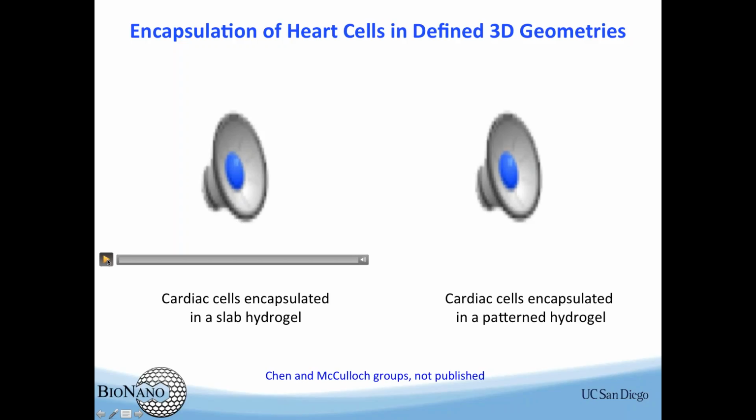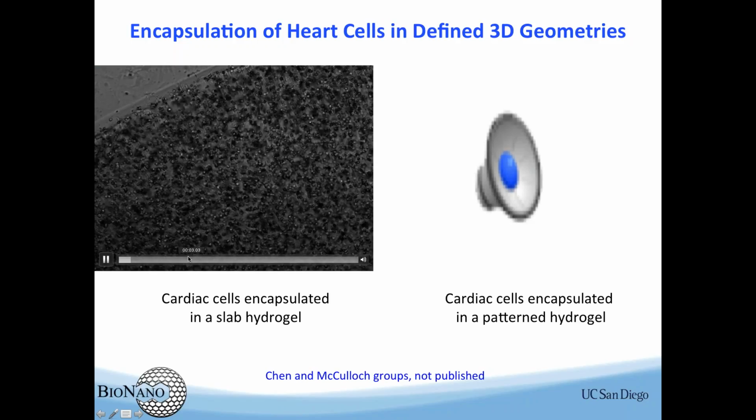So the best way to show the cells can survive this kind of process is to use cardiac cells. For cardiac cells, if you put them in the culture, day 5, day 7, they start to beat. So here, this hydrogel is not a regular hydrogel. It's a live hydrogel with cells embedded in it, and especially this cardiac patch, the cells can beat, and when cells beat, the whole hydrogel is moving around. I mean, it is vibrating.